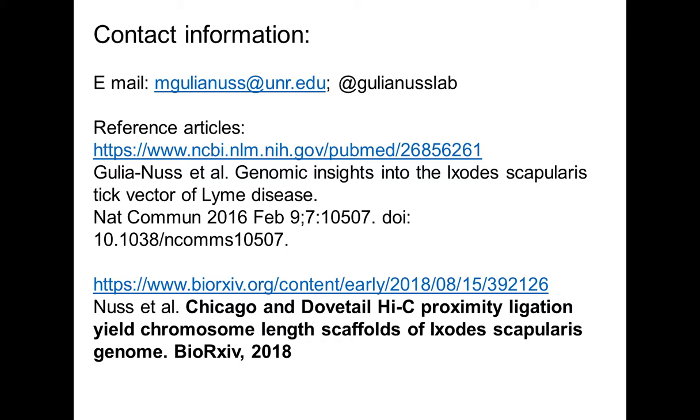Thank you. The next question is, does our draft assembly need to be built in any particular way before handing off to Dovetail for scaffolding? No. If someone sends a draft assembly to scaffold, we're agnostic as to how that assembly is built, as long as the minimum threshold is met of 20 kb N50 for Chicago and 1 megabase N50 for Dovetail Hi-C.